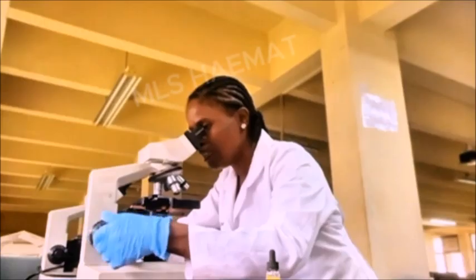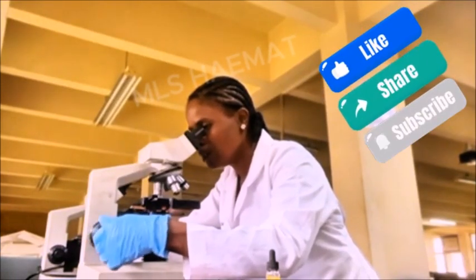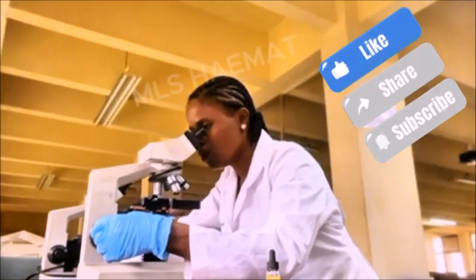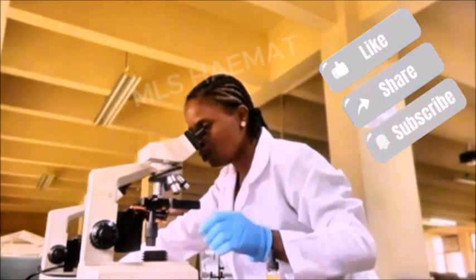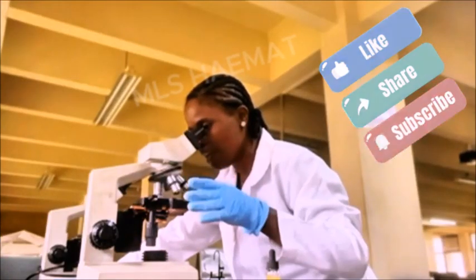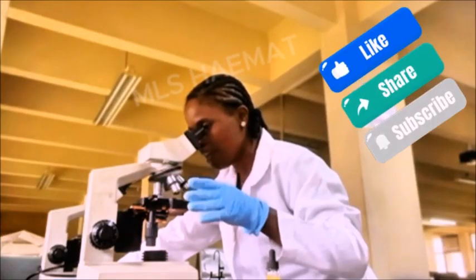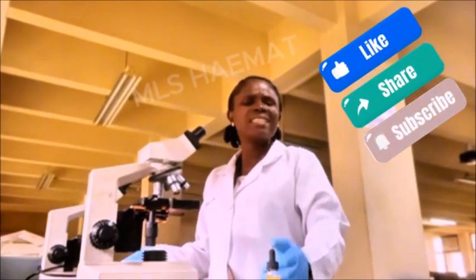As I keep rolling it, at a point, the view will change. I'm going to see, yes. So I am there. I can now see the cells. What I have here is actually gram-positive cocci in clusters. And it's very, very clear. And that is how to focus with the oil immersion objective lens in such an easy way.